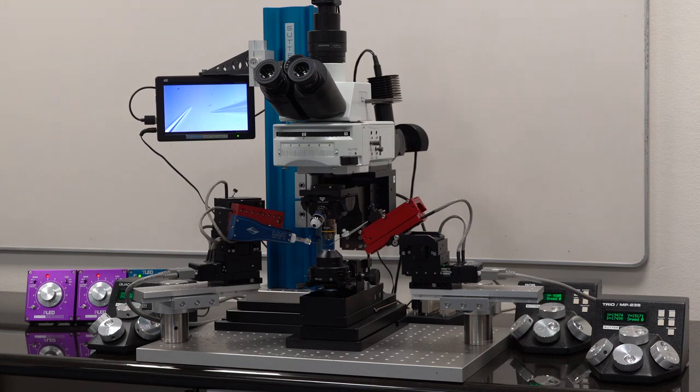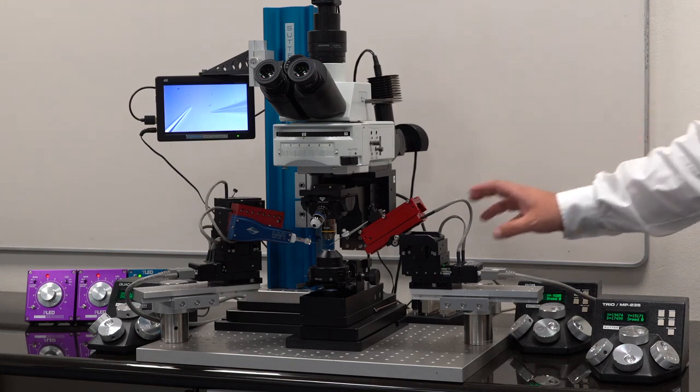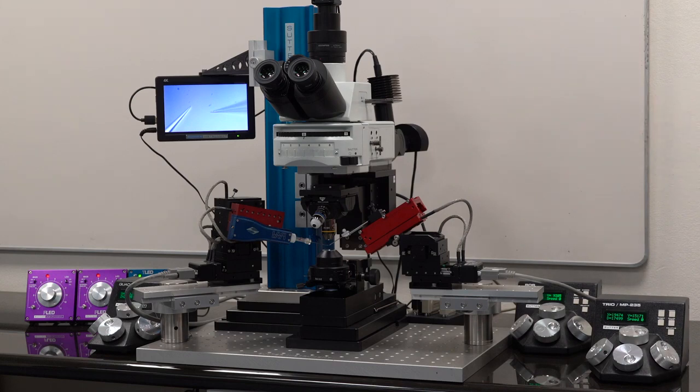This entire Bob system is mounted on a motorized XY translator that moves 25mm in X and Y. And on top of that translator is a white light transmitted light system that's waterproof. And also contains the Olympus OCC condenser.